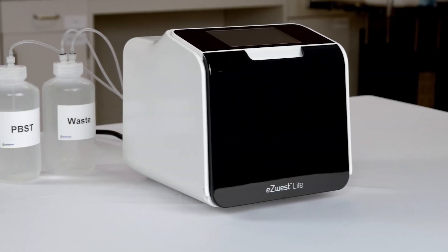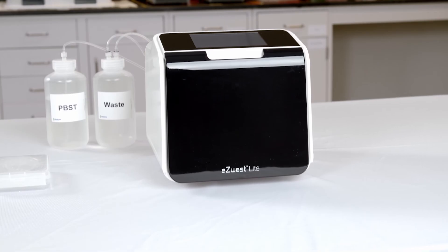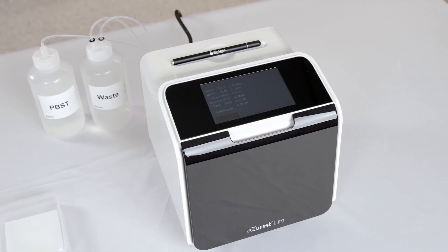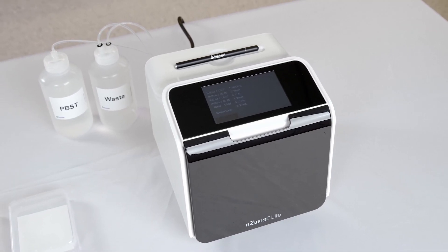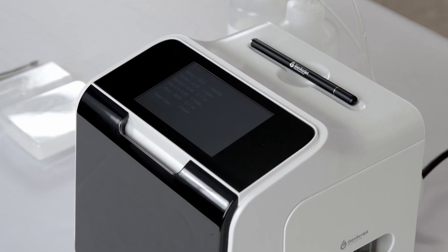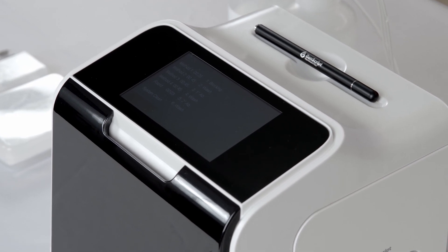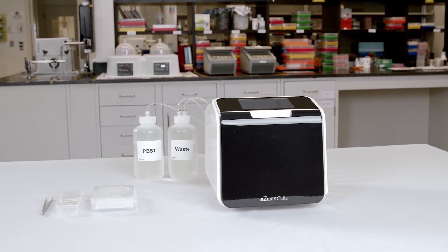Easy West Lite is a simple-to-use Western blotting device allowing researchers to free up hours of bench work. The device automatically completes the Western blotting steps, recovers antibodies, and delivers consistent results. Plan your Western days with Easy West and start saving time and money for a hassle-free solution.